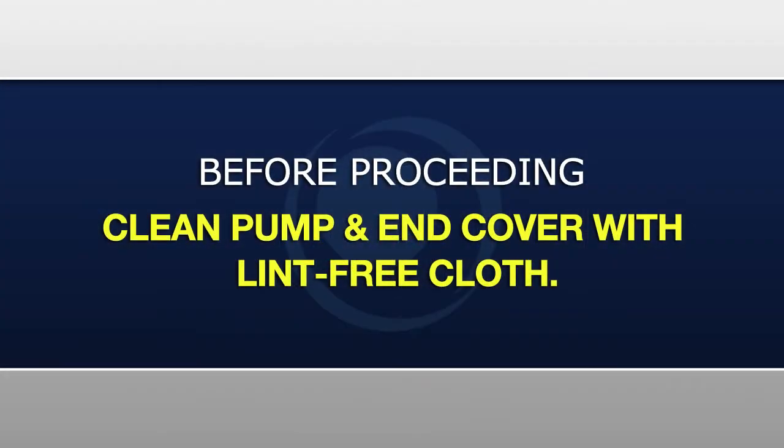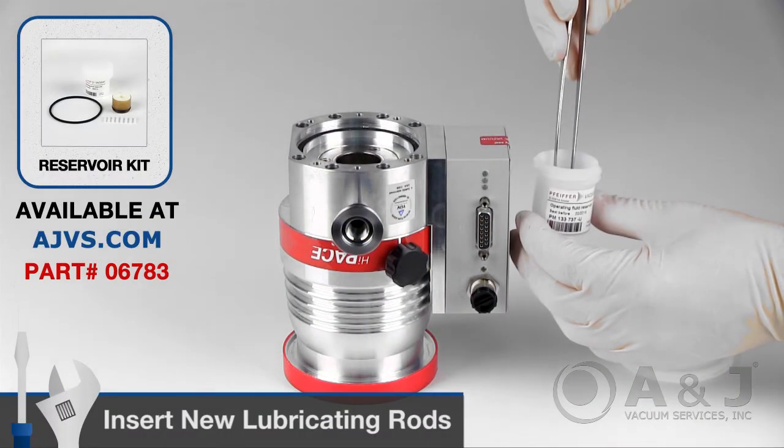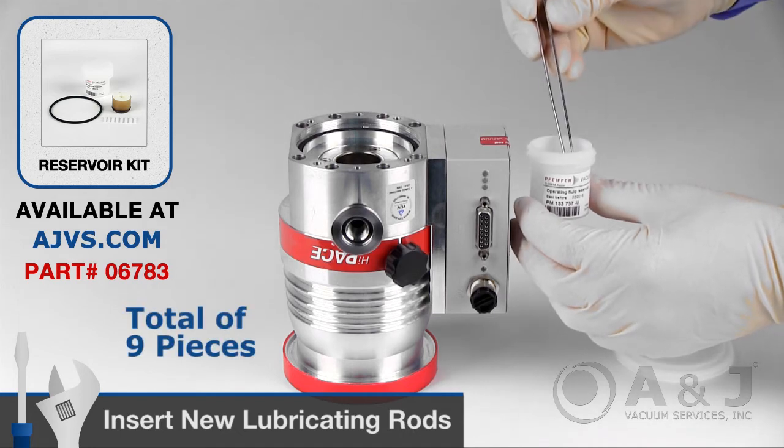Before proceeding, clean off any dirt on the turbopump and locking cover with a clean lint-free cloth. Using tweezers, insert all nine new lubricating rods.